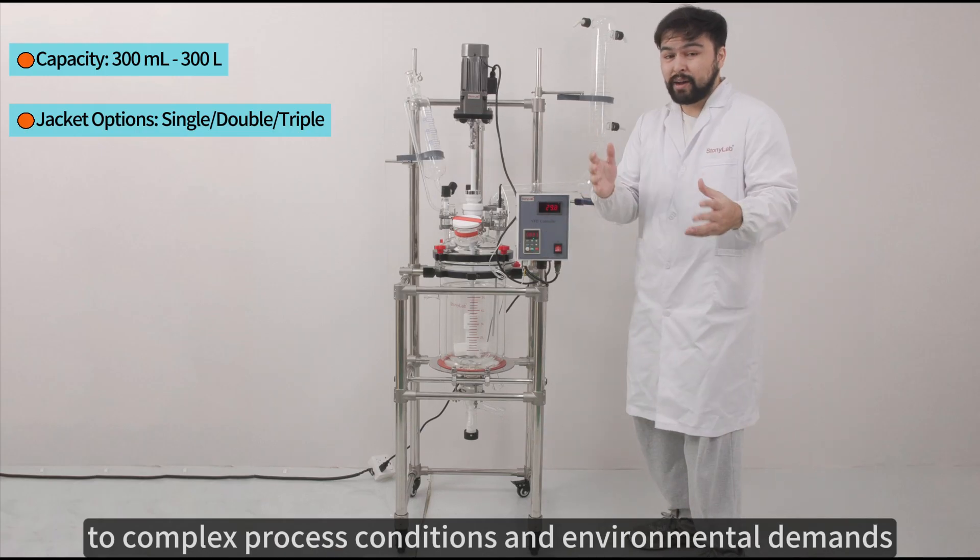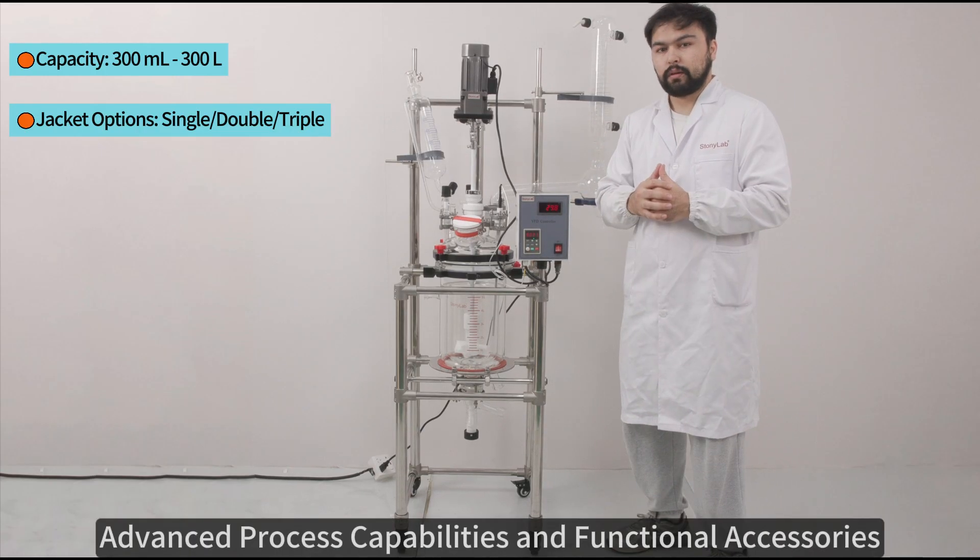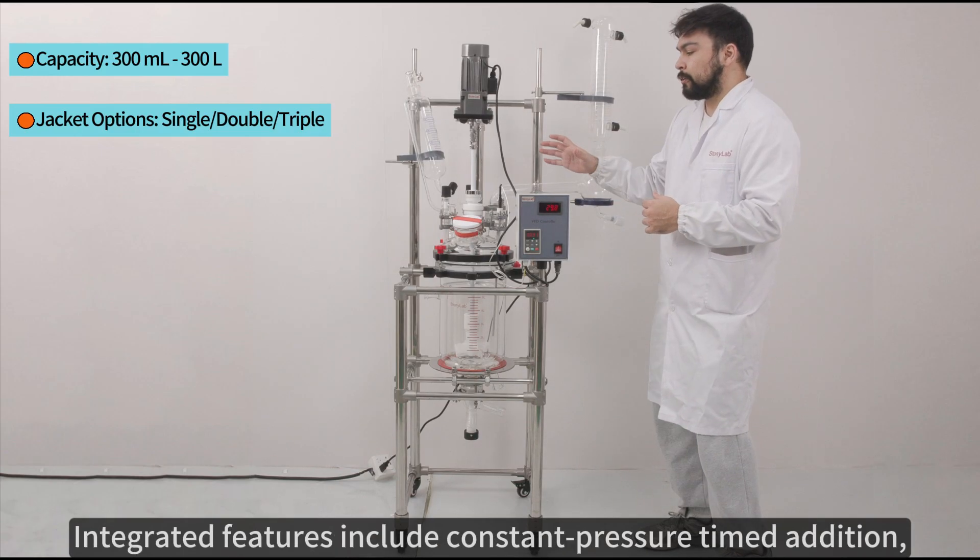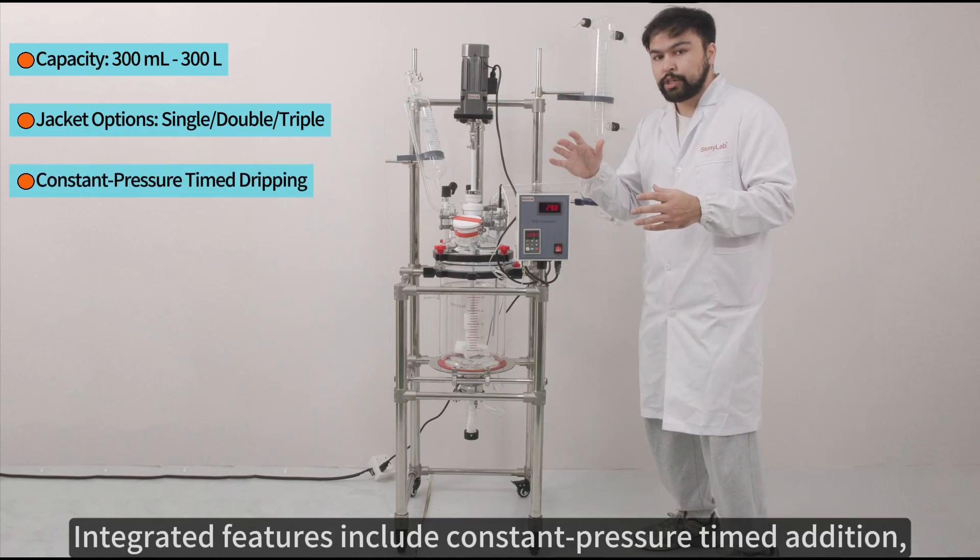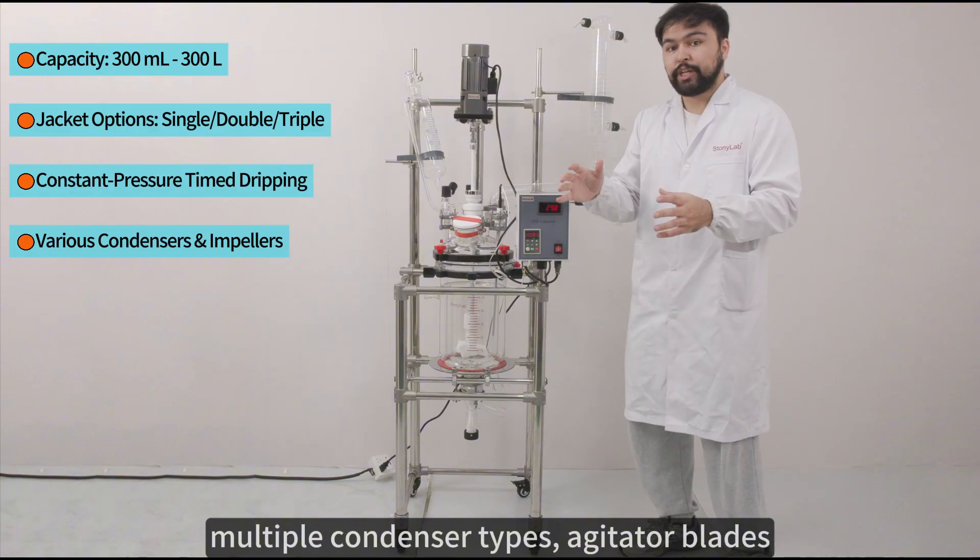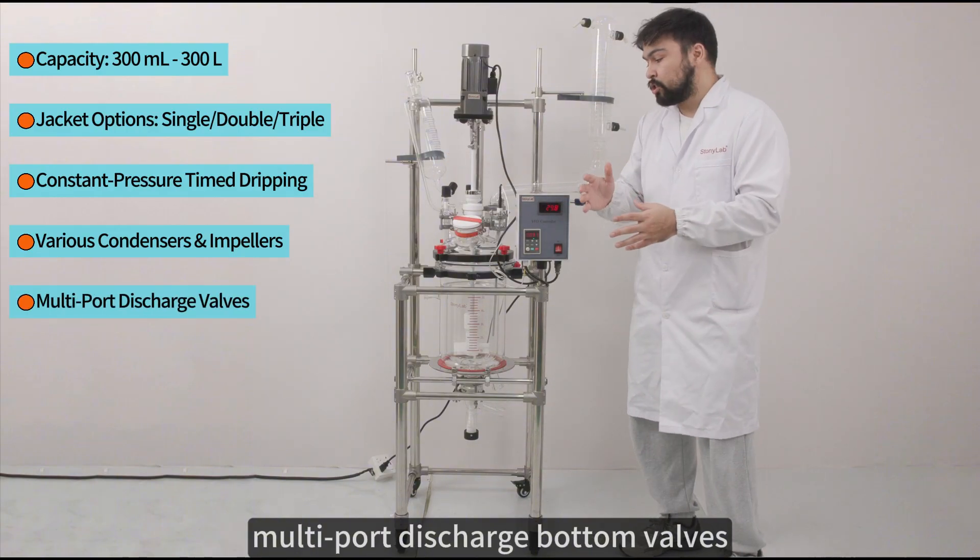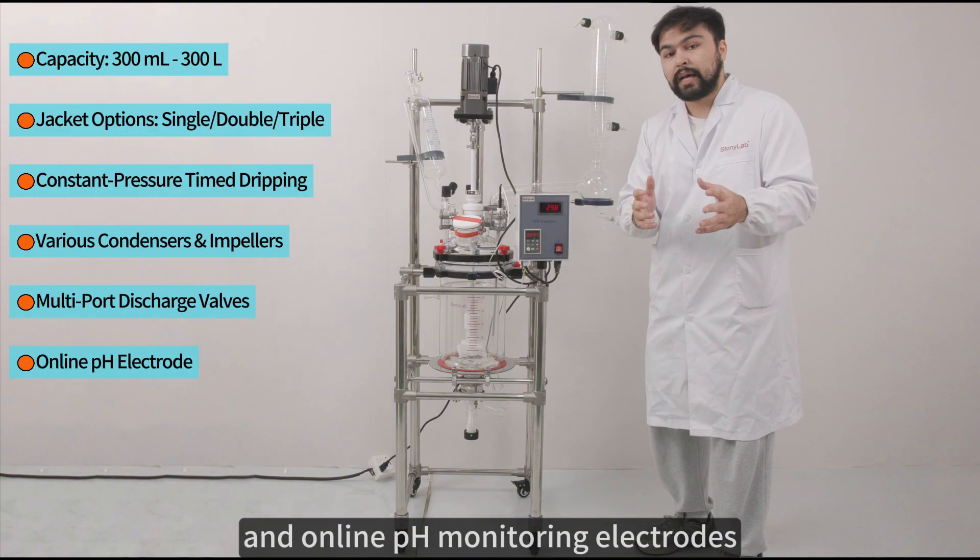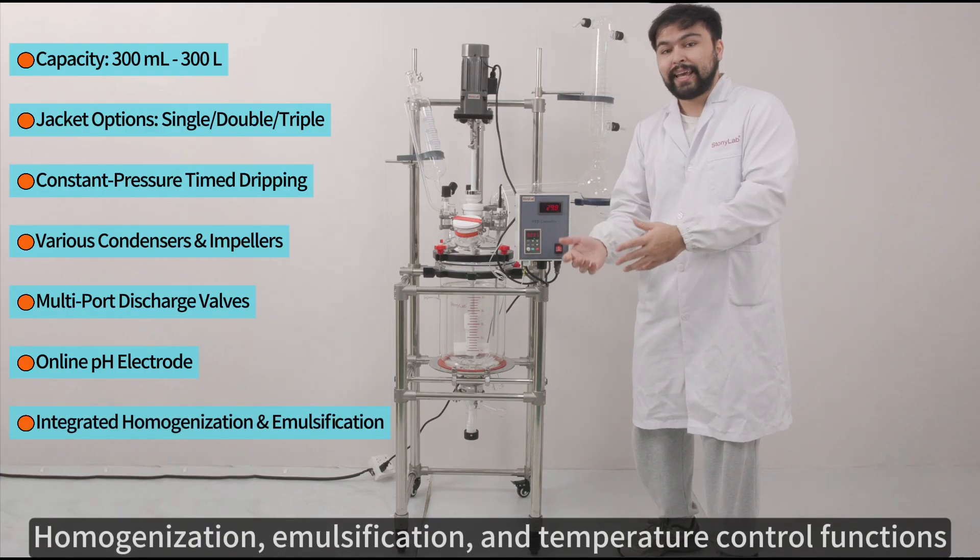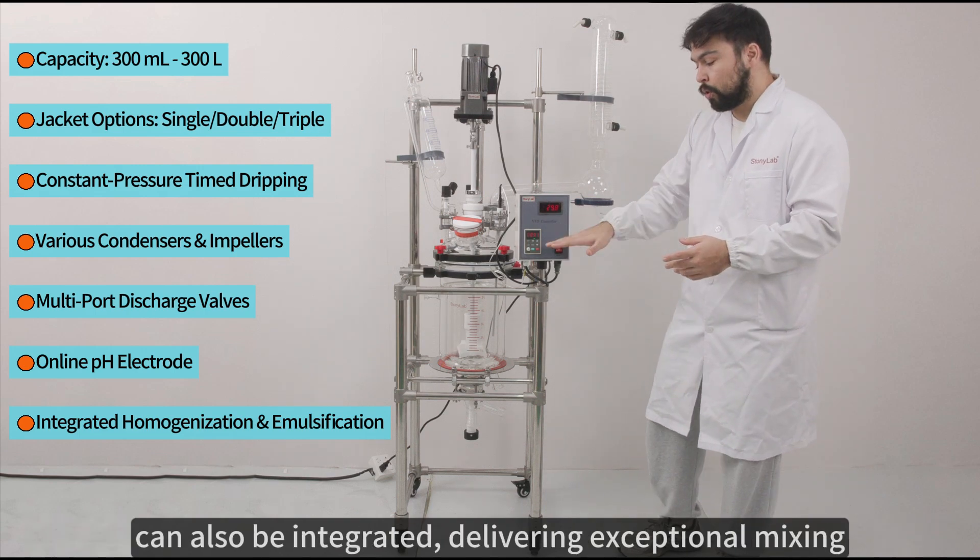Advanced process capabilities and functional accessories include constant pressure timed addition, multiple condenser types and impeller blades, multi-port discharge bottom valves, and online pH monitoring electrodes. Homogenization, emulsification, and temperature control functions can also be integrated.